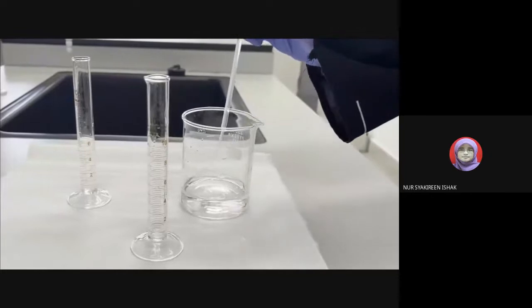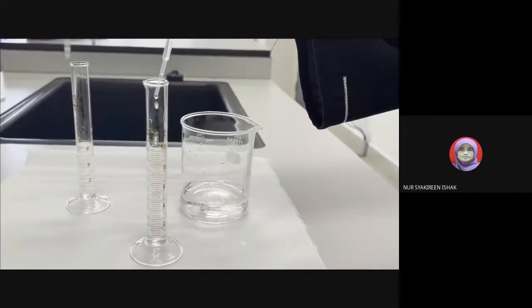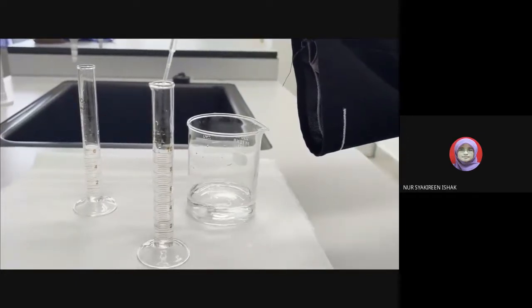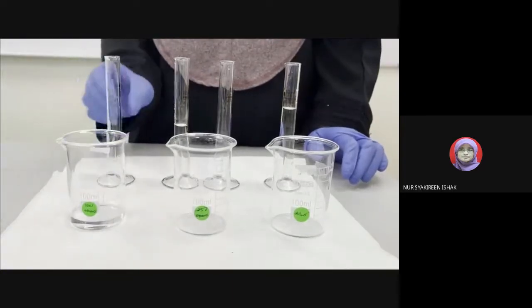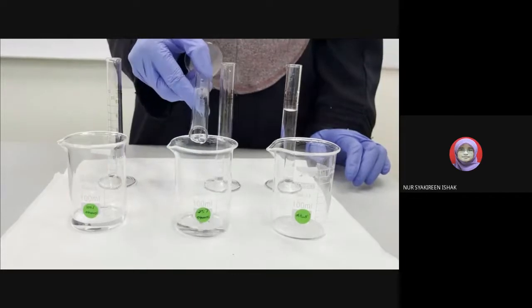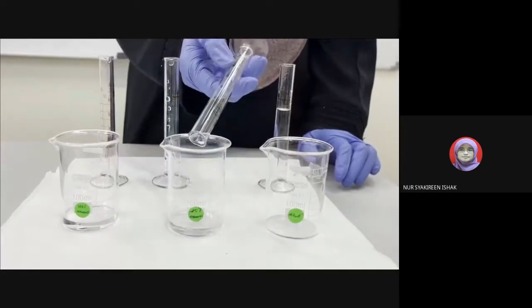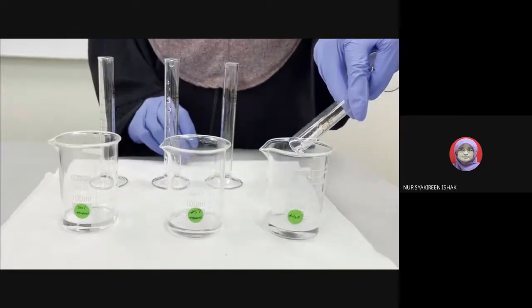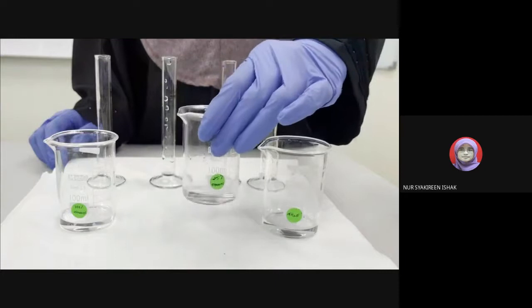Make a 25% dilution of ethanol. Total volume needed is 10 ml. So, in this video, we use 7.5 ml of distilled water and 2.5 ml of ethanol. Label 3 small beakers respectively. One with 100% ethanol, second one with 25% ethanol. As you can see, we are mixing the dilution now. And finally, a beaker labeled distilled water. Fill each beaker with its respective solution of 10 ml each.